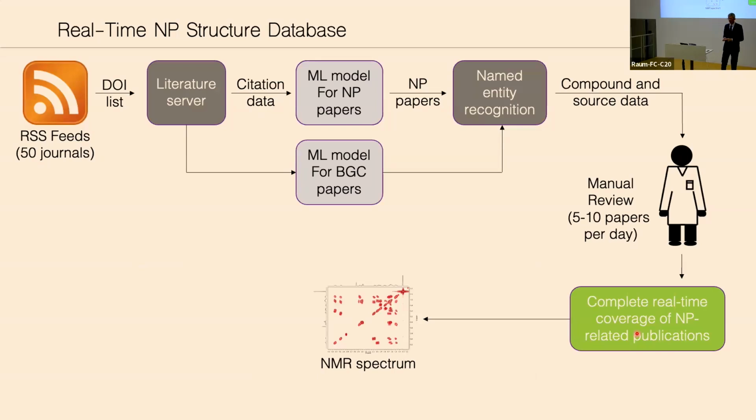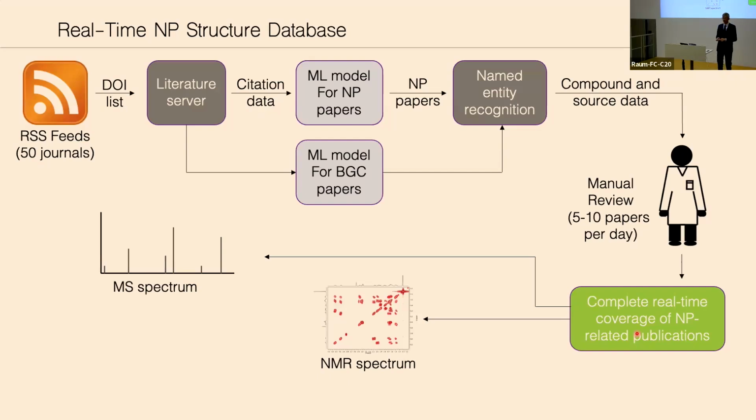But actually, once you've built the environment where someone can submit the data that goes with their paper, NMR data is comparatively complicated. Encouraging them to submit their MS data at the same time, and then delivering that MS data to their repository of choice is not an unreasonable thing to think about doing. So we definitely do not do this at the moment. It would be a whole other layer of complexity.